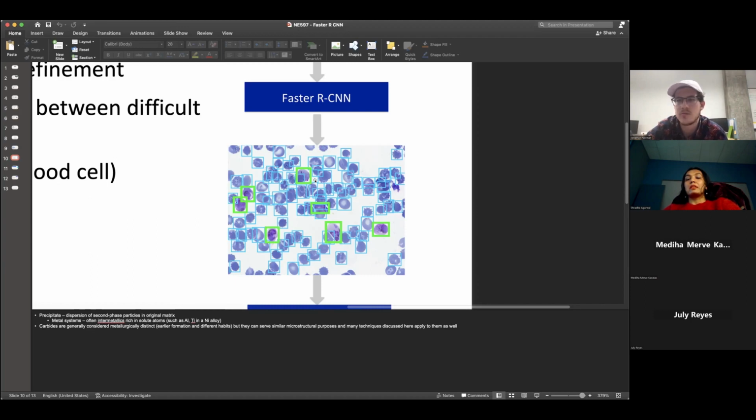Yeah, so it definitely does some level of image analysis, but it's decoupled from the main convolutional neural network that the rest of the process operates on. So it doesn't have that learning step where, following bounding box regression, it makes corrections to further improve the model. That's my working understanding of it.